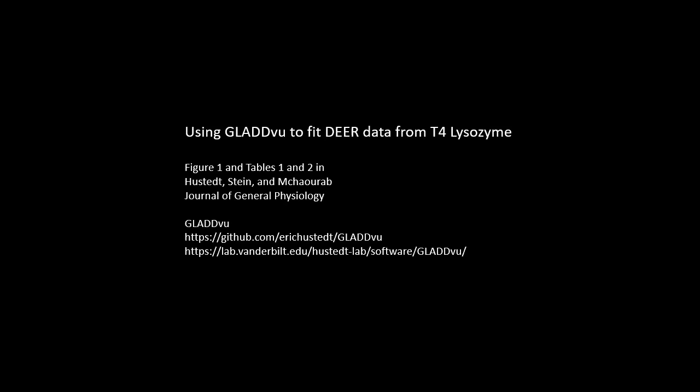DD is designed to fit single data sets, and GLADDvu has been developed primarily to perform global analysis, that is, the simultaneous analysis of multiple data sets with different parameters linked or not linked. Here we're going to just be using GLADDvu to fit a single data set, and it will be illustrative of some of the basic procedures that you need to follow to fit data in general using GLADDvu. So I hope this video is helpful.